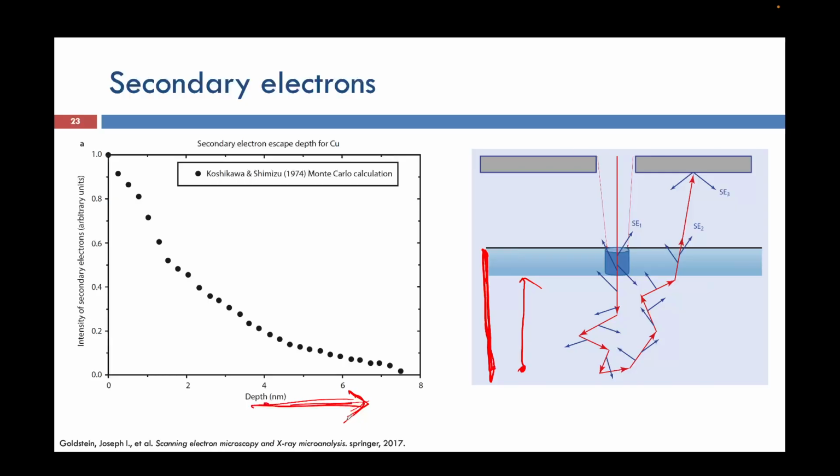Similarly, there is another concept, which is called the shallow escape depth. So what does shallow escape depth mean? Generally, electrons will first enter, right?